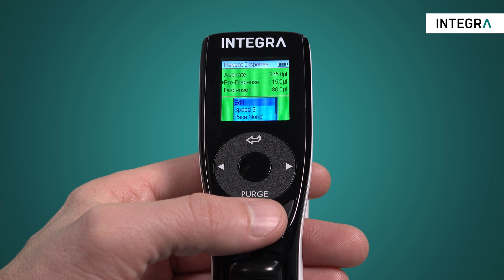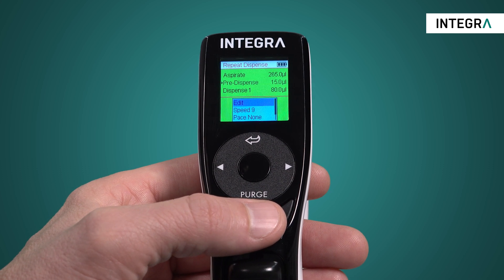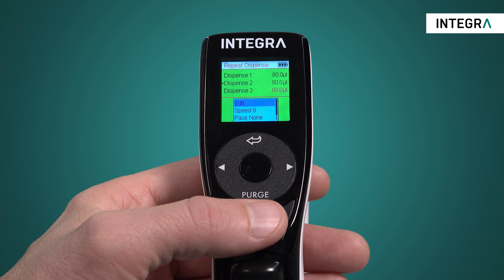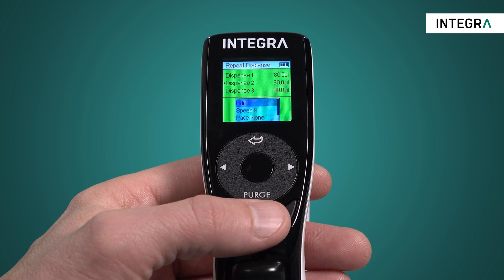For instance, starting with an aspirate, and now when run is pressed again, whatever is highlighted in black will be the next step: pre-dispense, then normal dispense, then post dispense until finished.